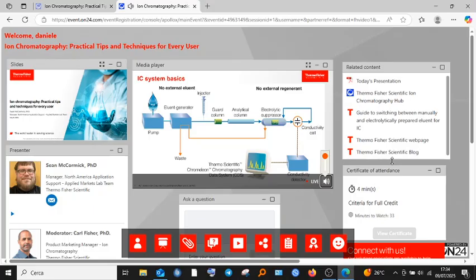Prior to reaching the columns, it must first flow through the injector. The injector is the access port in the system where a sample can actually be introduced. This can either be introduced from an autosampler or from a manual injection. Once the sample is introduced into the system, it flows through the guard column and then the analytical column. The role of the column is to be the site of the actual separation. This is the stationary phase. In the case of ion chromatography, separation occurs based on ionic characteristics. Charge is an example of one.